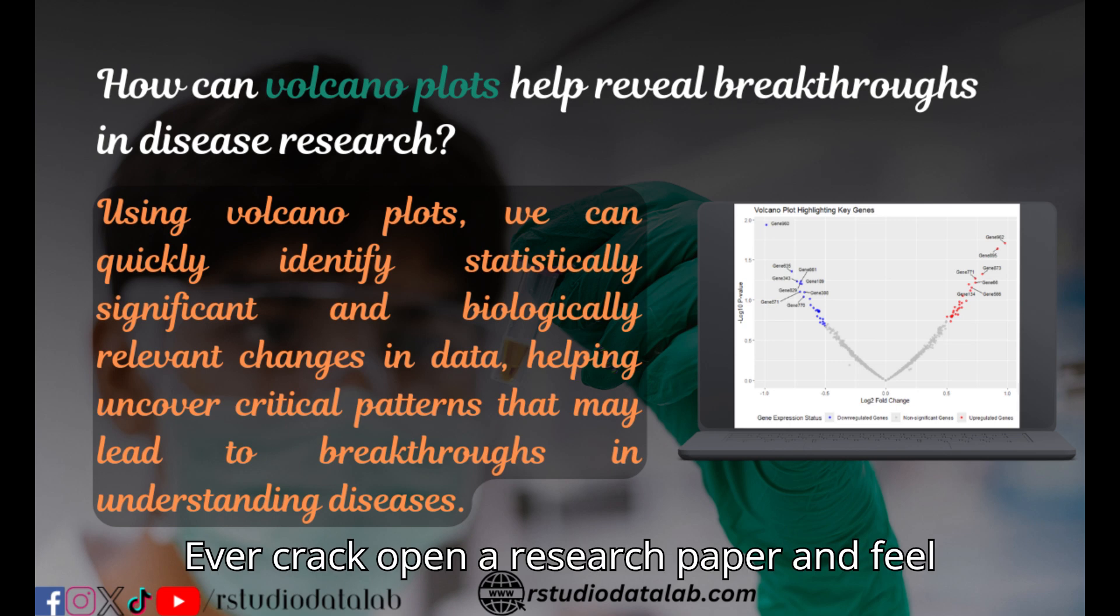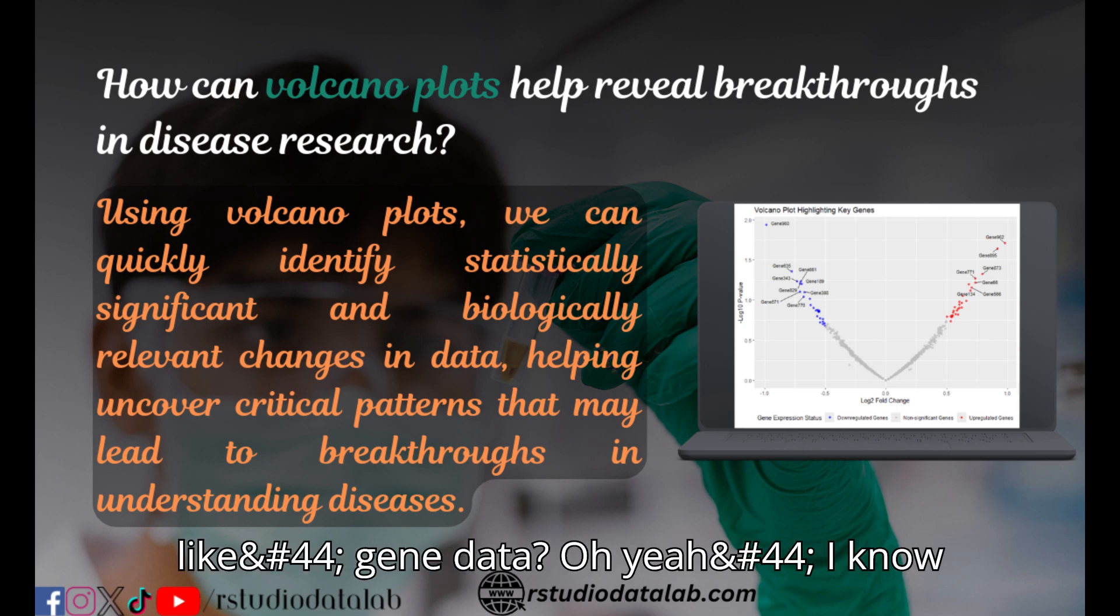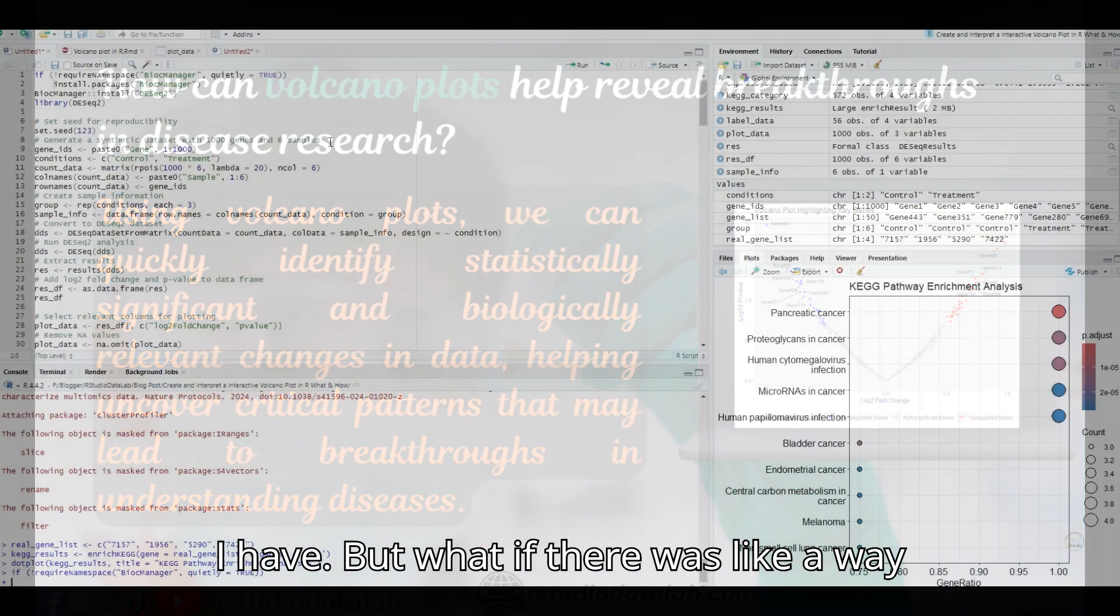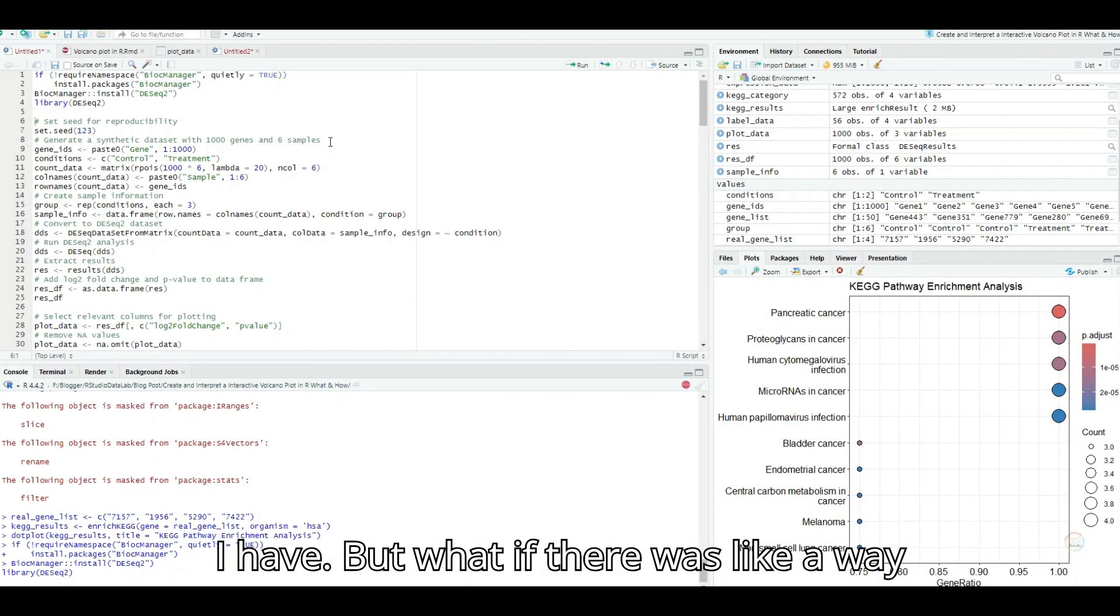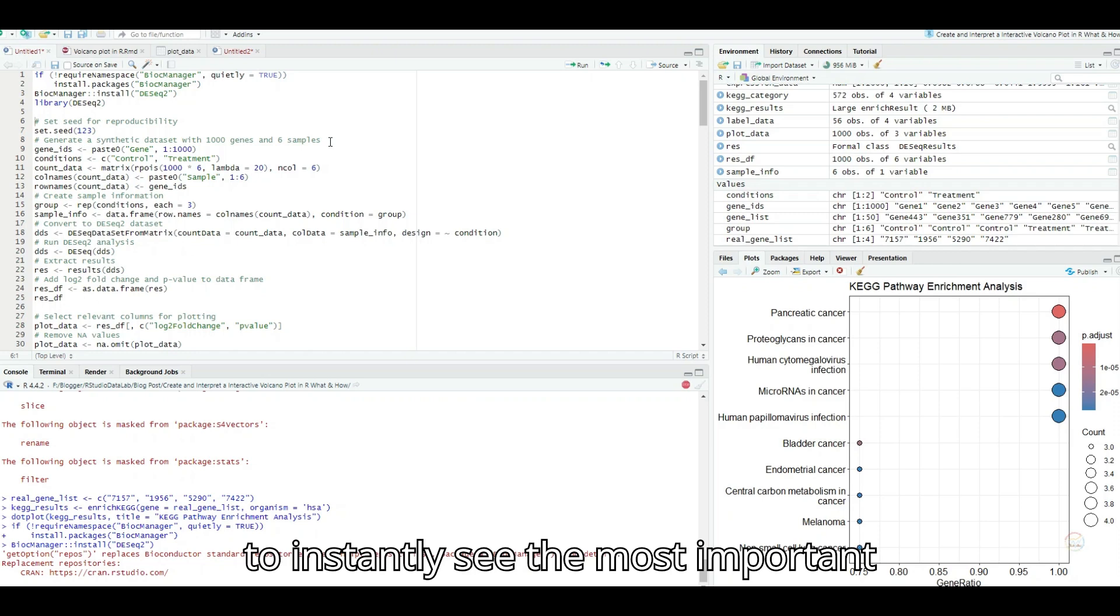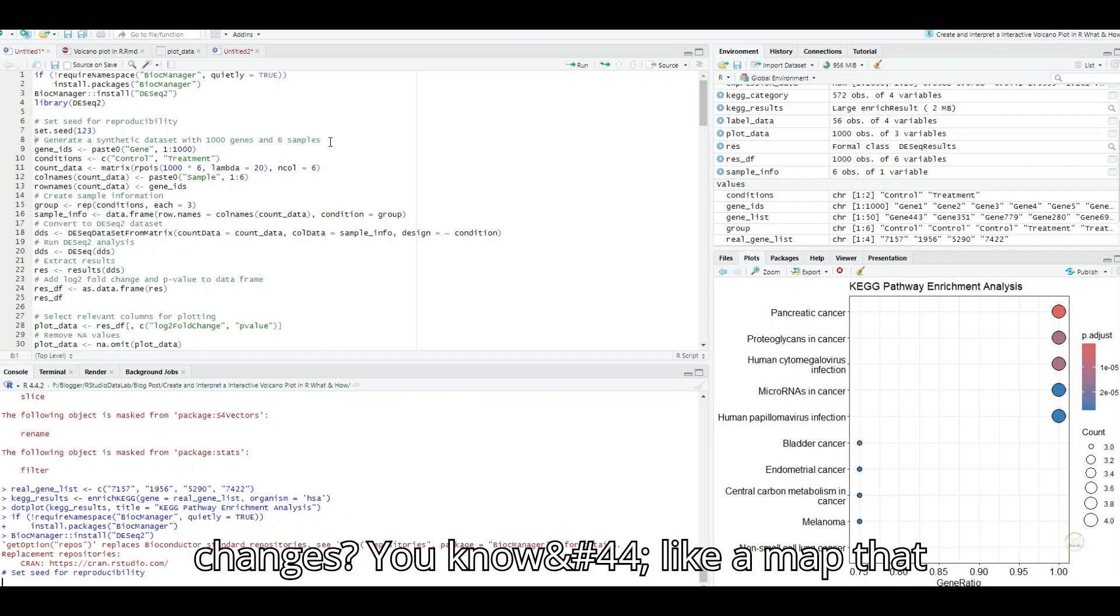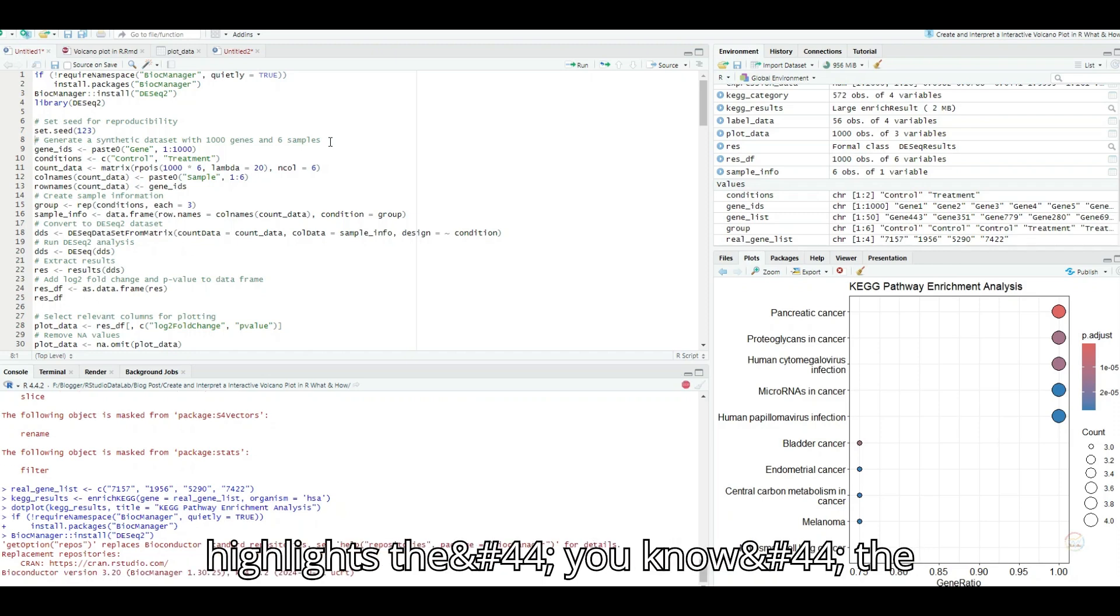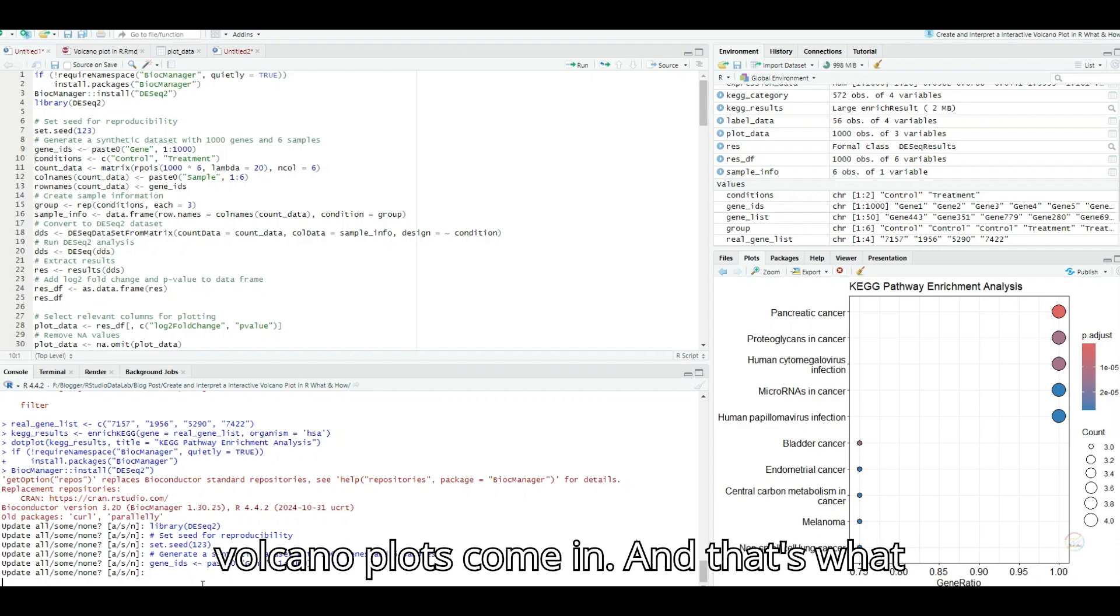Ever crack open a research paper and feel totally lost in a sea of gene data? I know I have. But what if there was a way to instantly see the most important changes, like a map that highlights the highest peaks? That's where volcano plots come in.